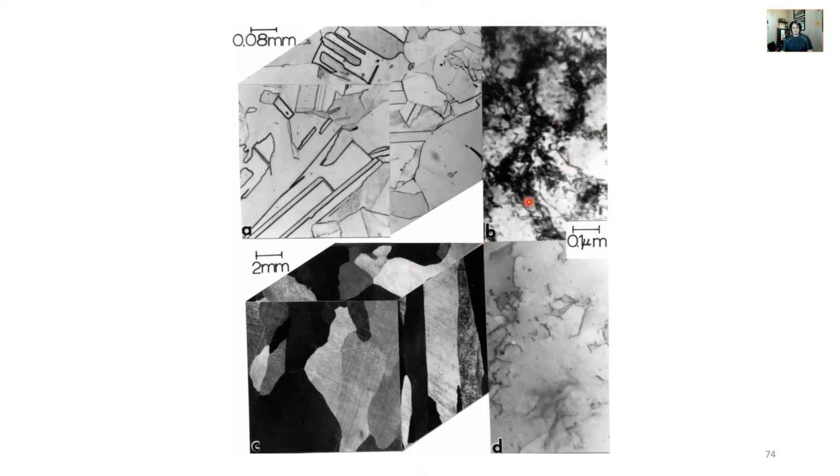And we also have dislocations, so we could actually make a modified Hall-Petch equation that takes into account dislocation density or cell diameter. Here are much fewer dislocations in this material and actually really big grains. So really interesting here. Big difference, see it optically, see it using TEM as well.